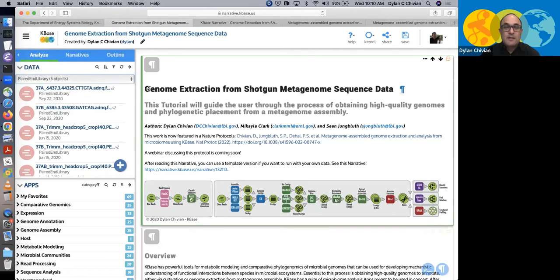And I need to get on my soapbox here for just a second and explain how important doing different enrichments and subjecting your samples to different conditions is. It is absolutely going to give you the best results when you're trying to recover genomes from them.